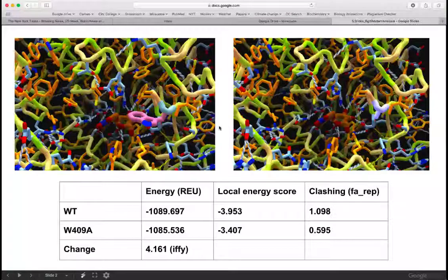There's the substrate once again, and here it is again. And this is the original protein. So remember, this tryptophan here was the original amino acid. Right, and that's just a side chain that I've circled. And here is alanine that I've changed it to, and that's a tiny side chain. All right, and you can see this substrate is much more exposed now with the alanine substitution.